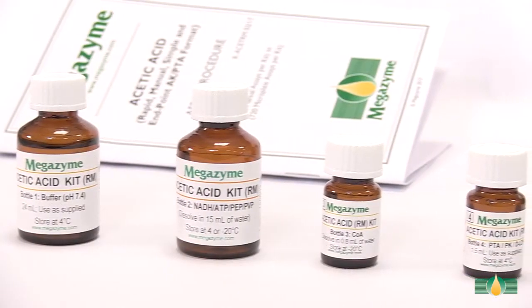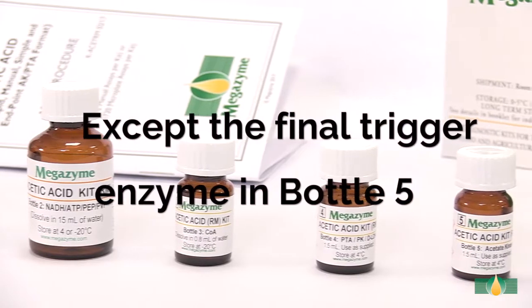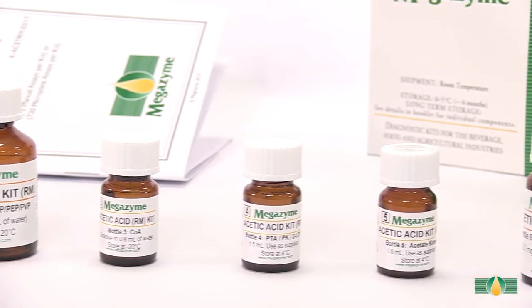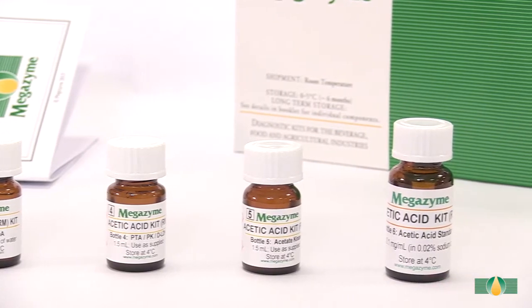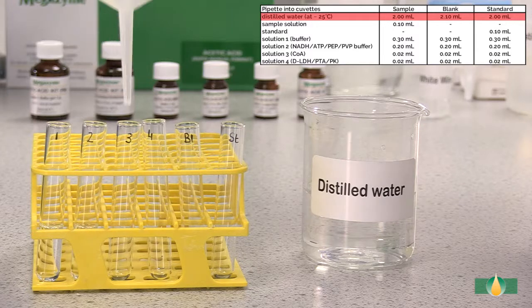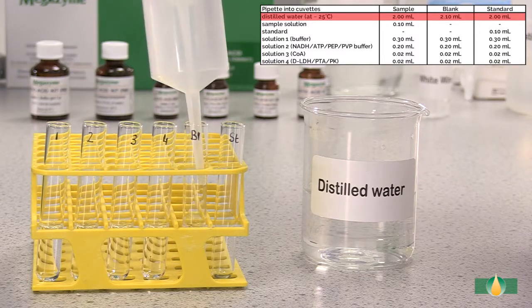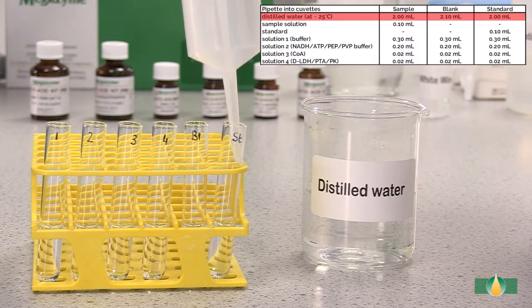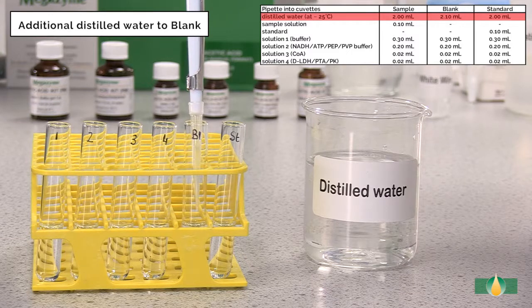Pipette all assay components except the final trigger enzyme in bottle 5 into each assay tube. A blank reaction and a standard reaction must be performed with each batch of samples. Pipette 2.0 milliliters of distilled water into all assay tubes. Add an additional 0.1 milliliters of distilled water into the blank assay tube.